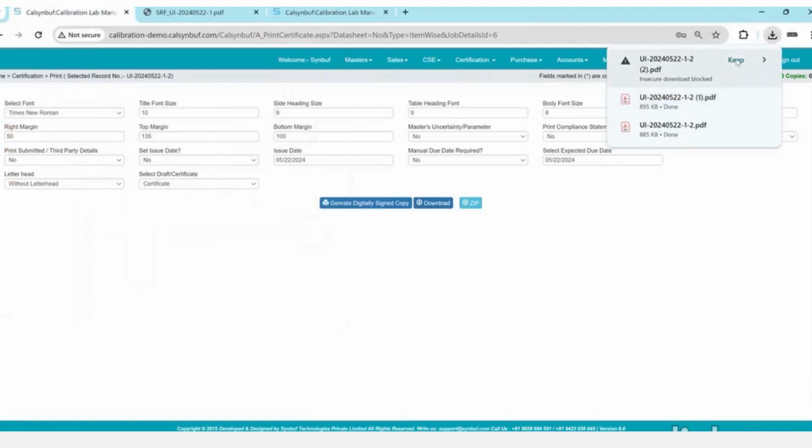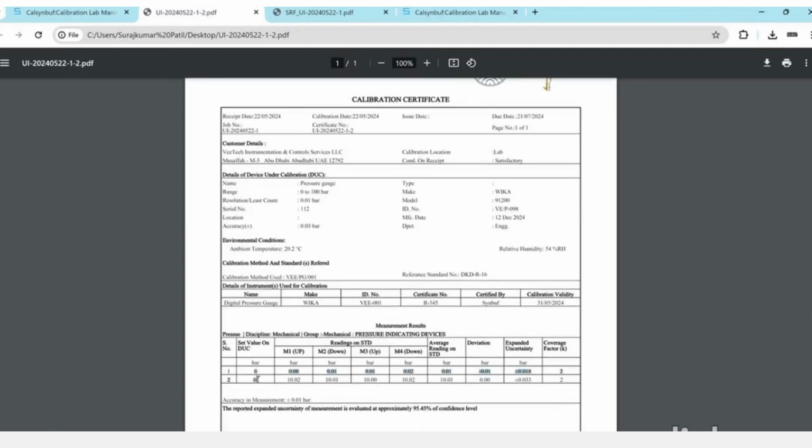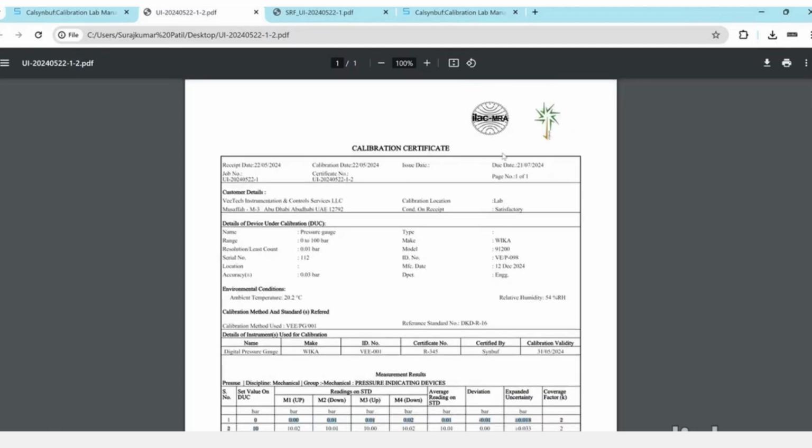Now, attention. I have taken 3 prints. This one is with the accreditation logo. It means I have considered that your letterhead is already available with you without accreditation logos. These logos can be controlled by software. If your inward is non-accredited, then this SSC logo will not print. If any one test point is out of scope, then this ILAC logo will not print.